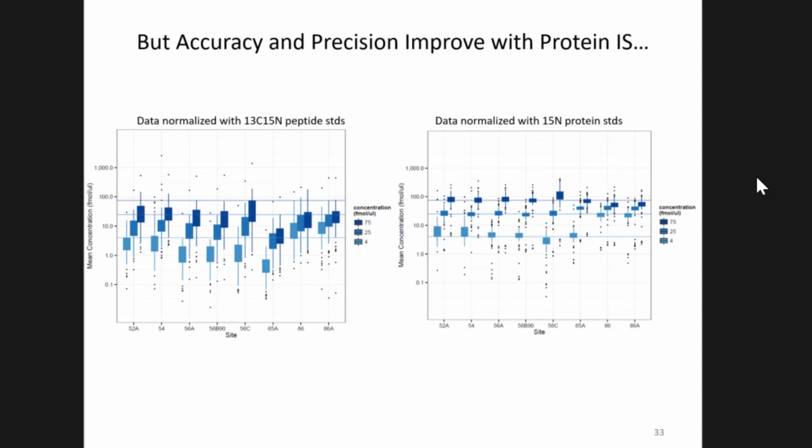But yeah, we didn't include any others, although we could have, right? So we wound up having between 3 and 5 peptides per protein for these experiments. We could have added in more if we wanted to go through and look and then include them in the transition list for the triple quad.